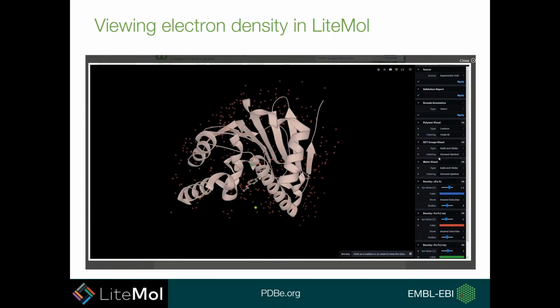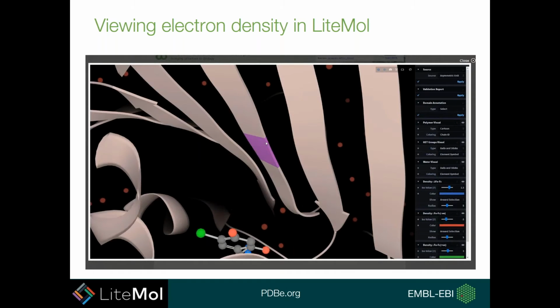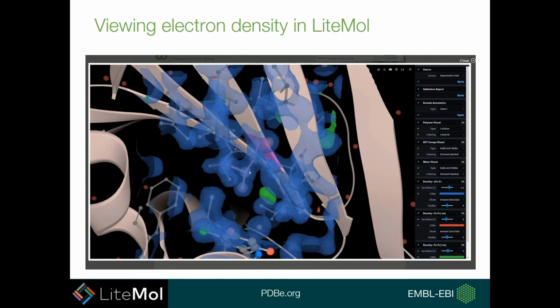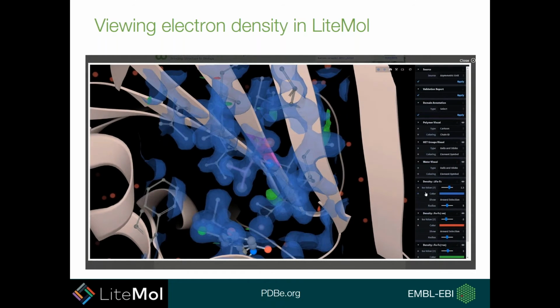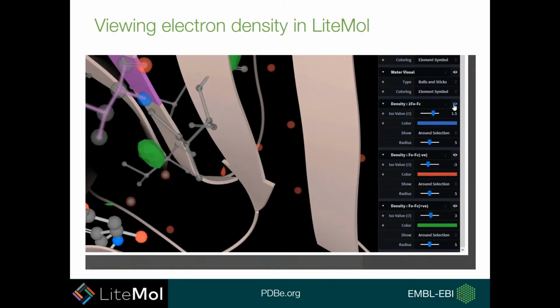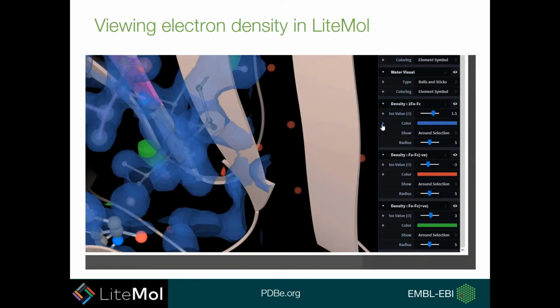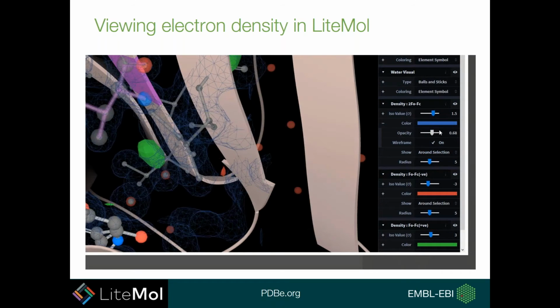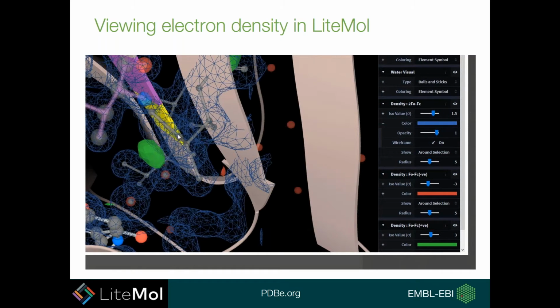And here's a quick video to show you how this works. If you go with your mouse and click on a particular residue, this will zoom in around this region and automatically generate density for this entry in a 5 angstrom radius. There are more options for toggling your density maps here. If you use the I symbol on the side, this will toggle your density on and off. You can also open the color area, and you can show wireframe if you wish to, and change the colors of your maps if you wish to as well.